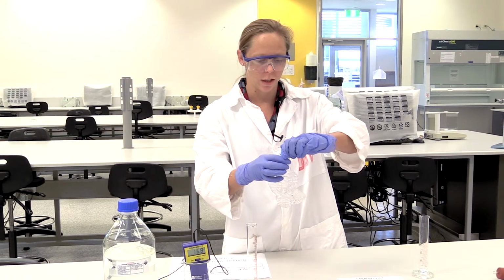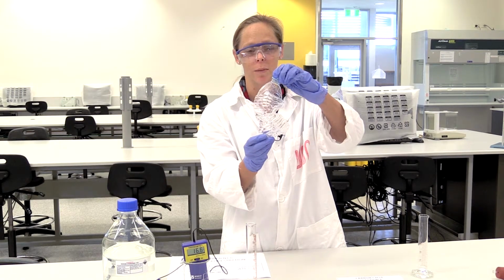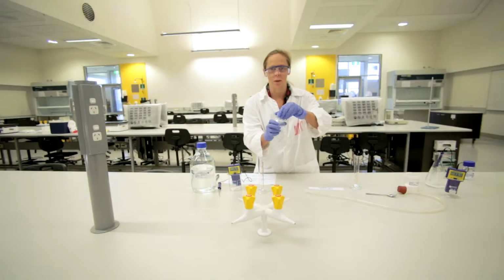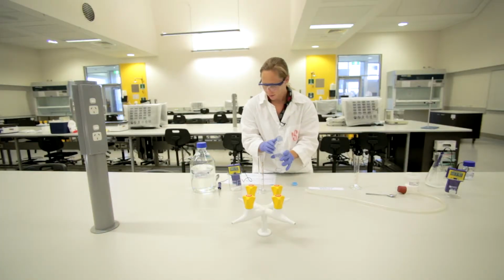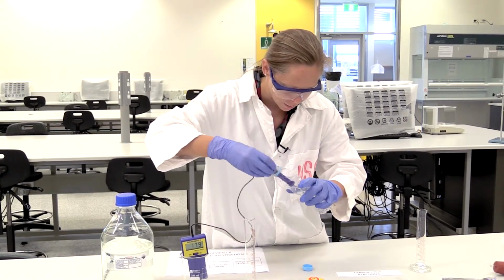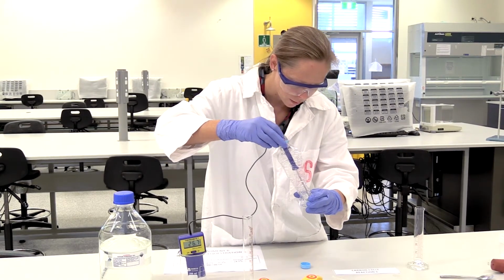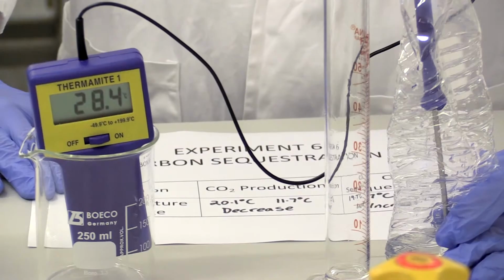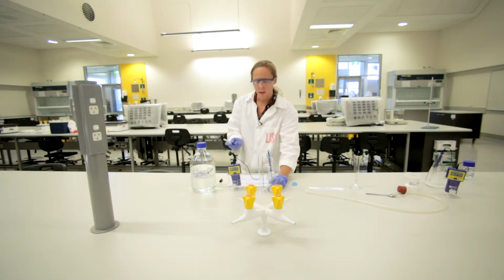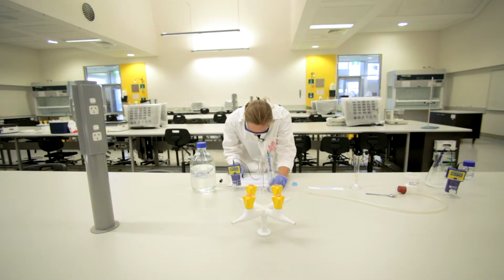So now we're going to just check the temperature. You can see that sodium hydroxide definitely does sequester carbon dioxide from the atmosphere with our decrease in volume of our bottle, but we'll just check what the temperature is. Okay, so clearly, unlike our other reaction, we can see an increase in the temperature.